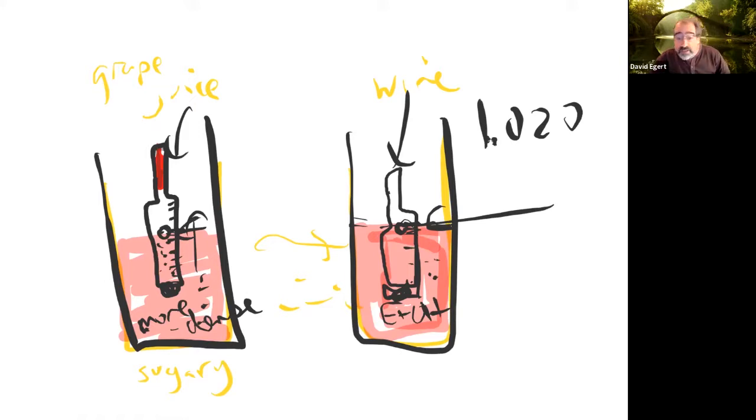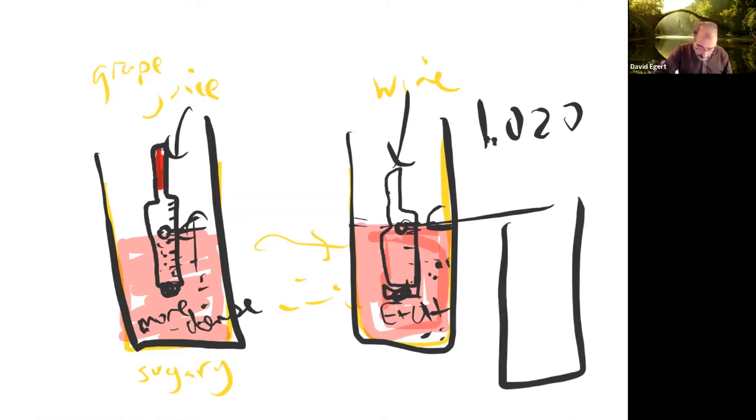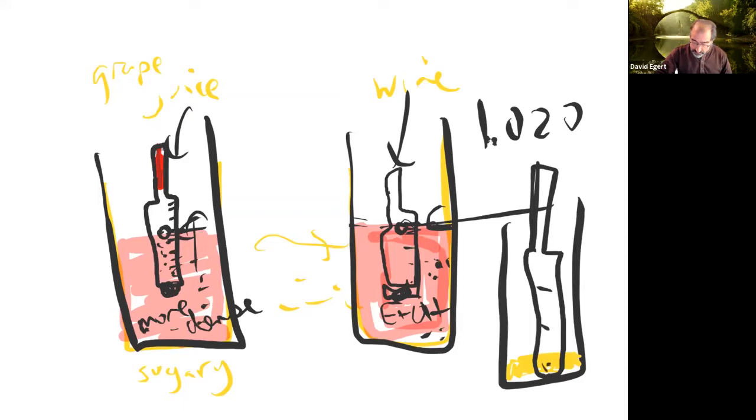The one thing about taking it this way is you need enough urine to actually float it. So if, like in group 3, you are peeing so little that there's not much pee left at all, and you try to put the float in to see where it floats, there's not enough pee to make it float.